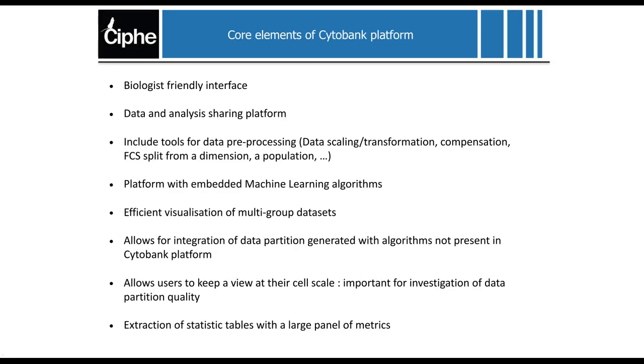So first slide that I wanted to show is this one. It's, to my view, the core elements of the Cytobank platform and why it's of interest to all of us. First, it's a biologist-friendly interface, so you don't need any bioinformatics skills to actually use it and drive your analysis. Next, you can do data sharing and also analysis sharing, which is very interesting. We will see how we can do that.